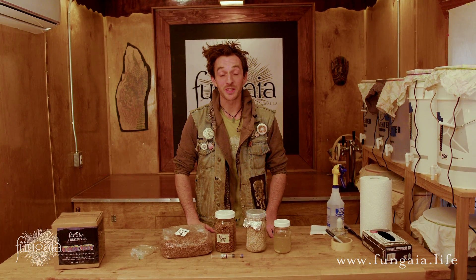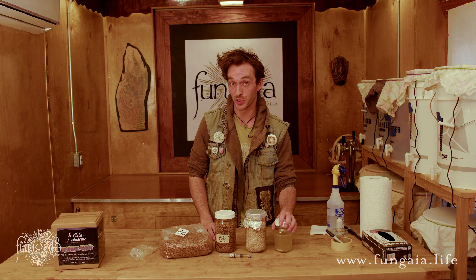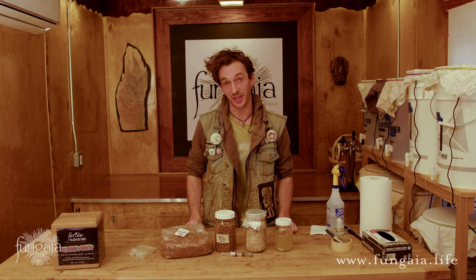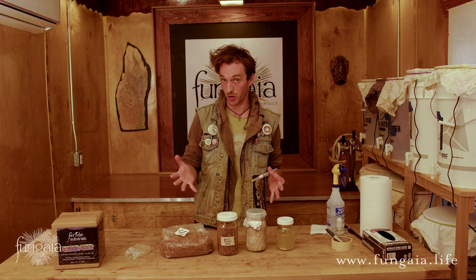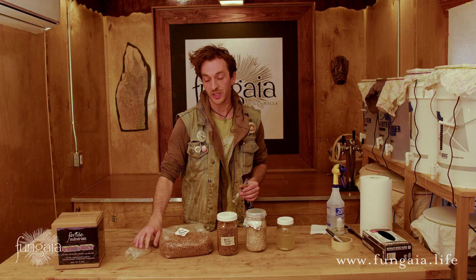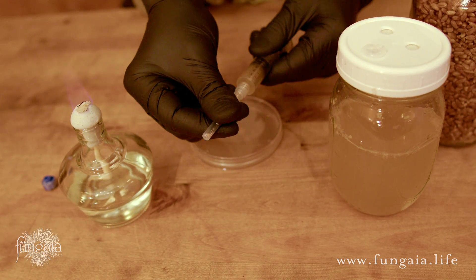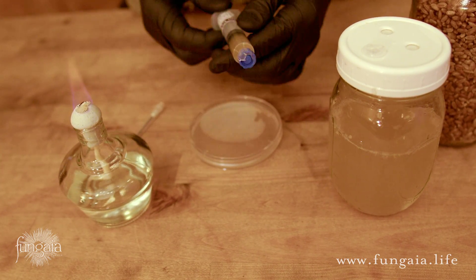The petri dish also allows me to continue working with that culture in the lab. I also like to use a little bit of the syringe to start a new batch of liquid culture — I can turn one syringe into dozens more. So to recap: whenever I get a new mushroom culture, I always start some grain spawn so I can grow it right away, start a little bit of liquid culture so I can keep it going, streak a little onto an agar plate, and then I always try to save the last little bit, cap it tight, and store it in the refrigerator for later. When I'm doing this, I take a little extra care to keep the cap sterile by placing it upside down near my alcohol flame and handling it with sanitized gloves.